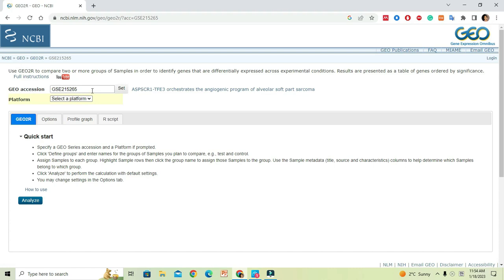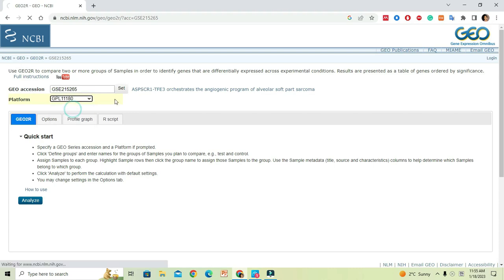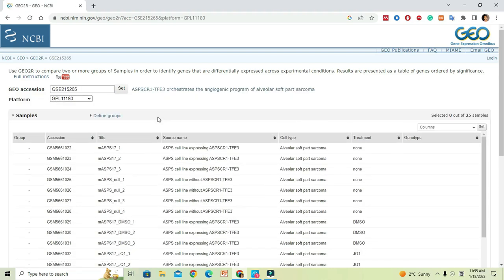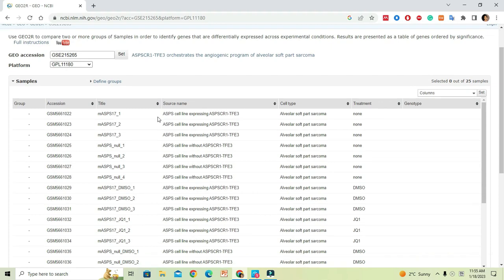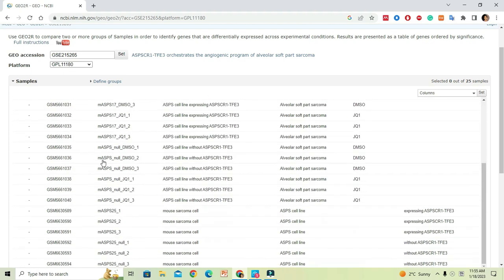Click on the link and that will bring you to the analysis platform. You can select the platform here, and that will populate the data related to that particular platform you have selected. This window is very important because it contains all the accession number details that represent the samples used in the study.